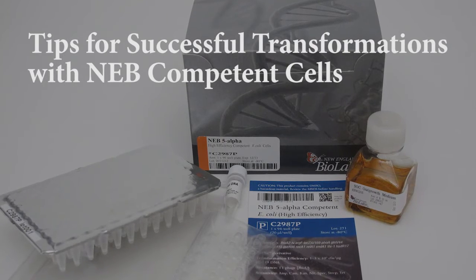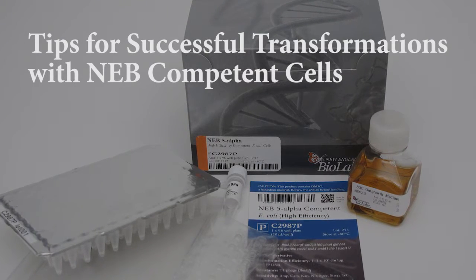Follow these simple tips to get superior results while transforming with chemically competent cells.